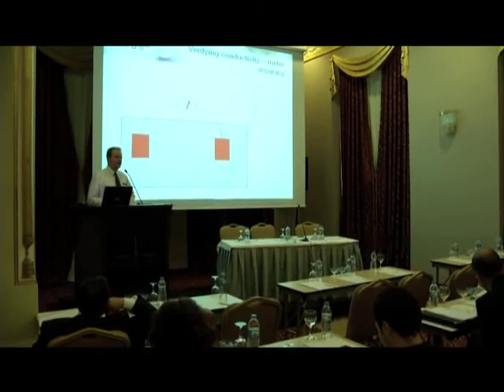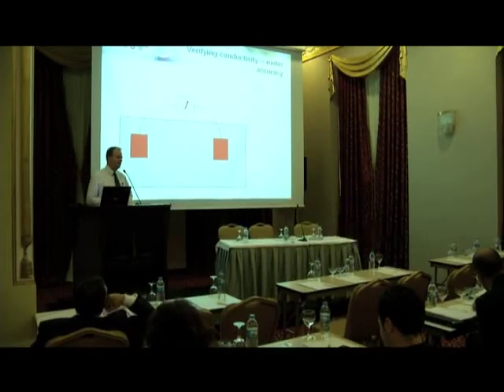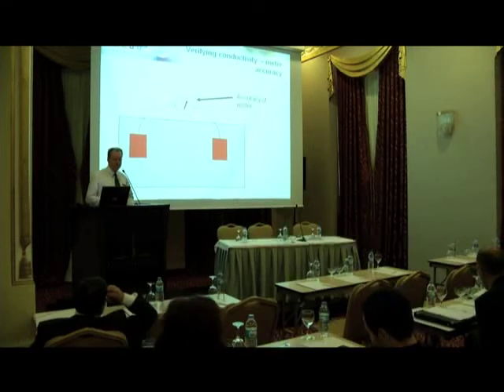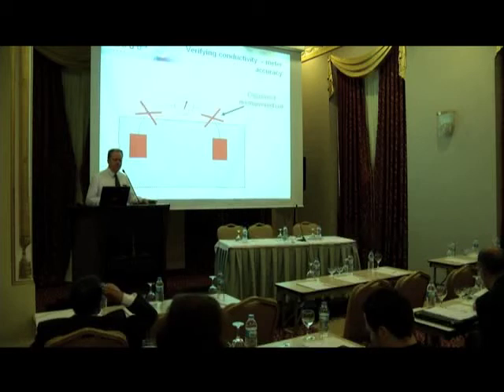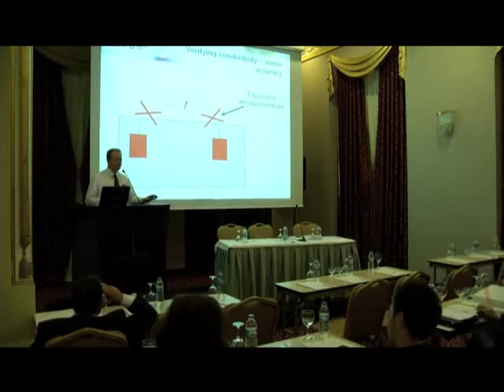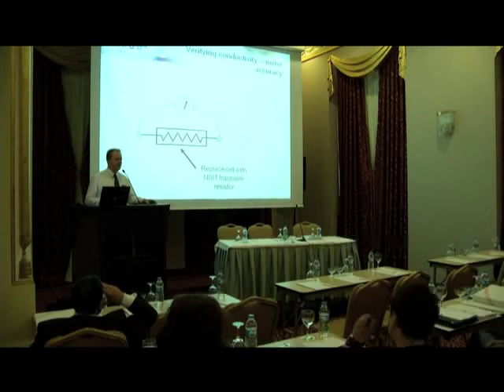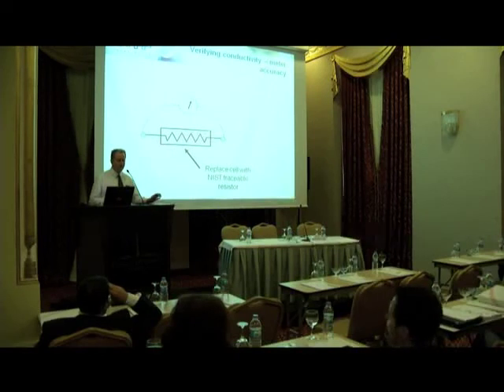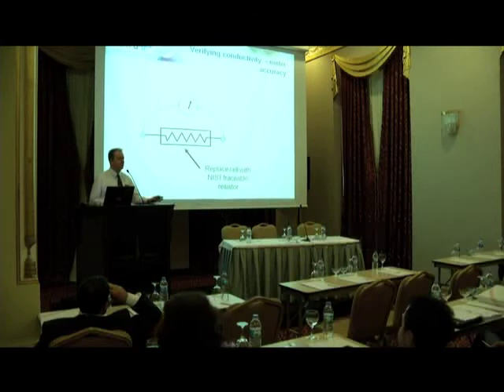For the meter accuracy itself, typically we would use a certified calibrated resistor for that. So we're checking the accuracy of the meter itself now. So we disconnect the connections to the conductivity cell, and we replace it with a certified calibrated resistor. So this resistor now will give us an accurate check on the meter to make sure that the electronics is interpreting the cell correctly.